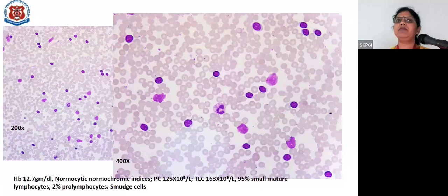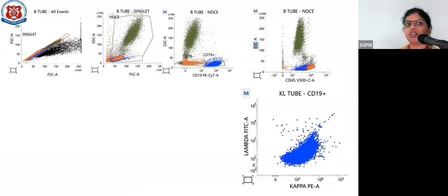So what we could tell him was a chronic lymphoproliferative disorder, but the cause of epistaxis was still not clear from this. So a CLPD panel from the peripheral blood sample was run. Here you can see the initial plots. This is the plot where we do gating in CLPDs by CD19 versus side scatter. We can see that the CD19 population is increased as compared to your CD19 negative. This is one of the abnormalities which we were expecting. And these cells are showing bright expression of CD45.